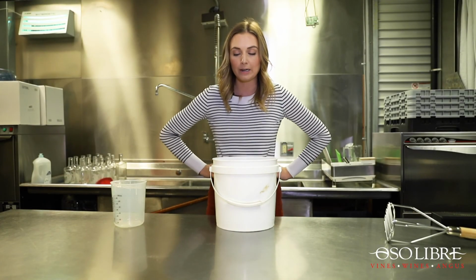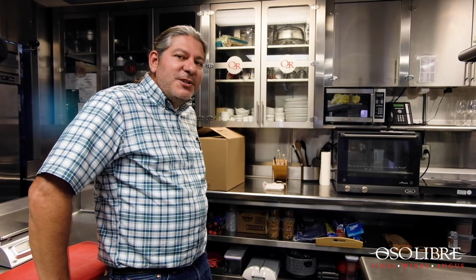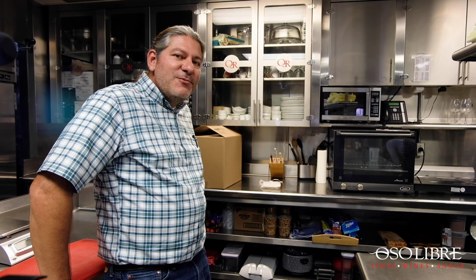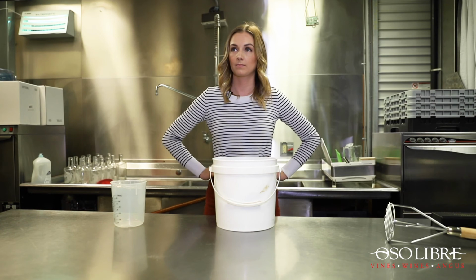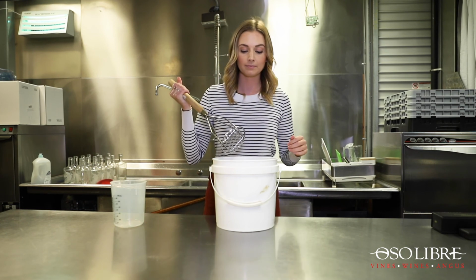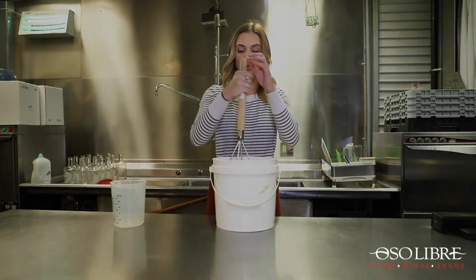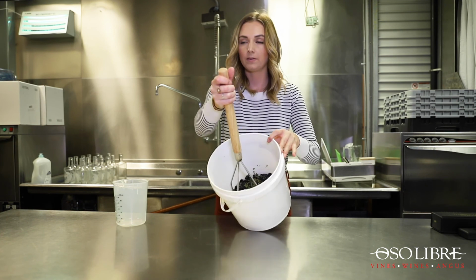We're back in the winery. Now what, Michael? Now that we're back in the winery, Janine is going to crush the grapes using a potato masher to get the juice out of them. And then we're going to take that juice and analyze it. So what I'd like you to do is take the masher there on the counter. This is going to be the workout for the day. And start crushing the grapes till you have hardly anything left. All right. How's that look?